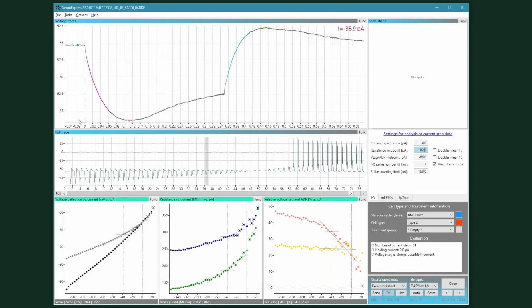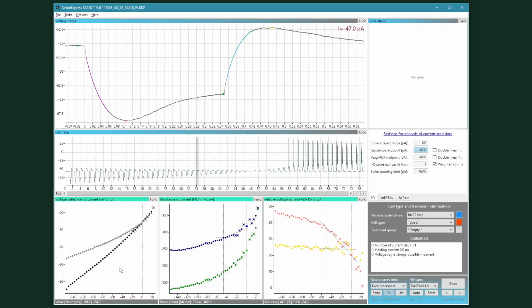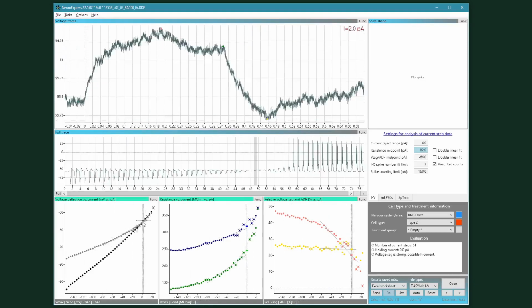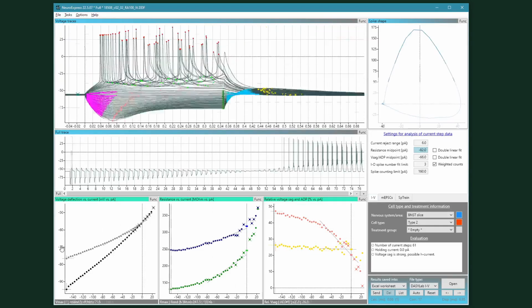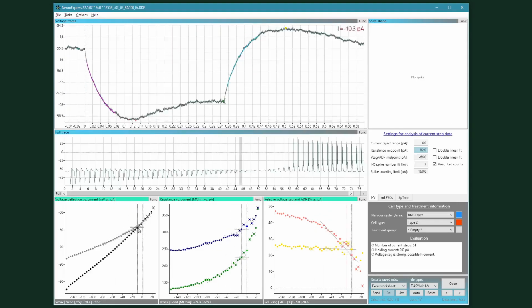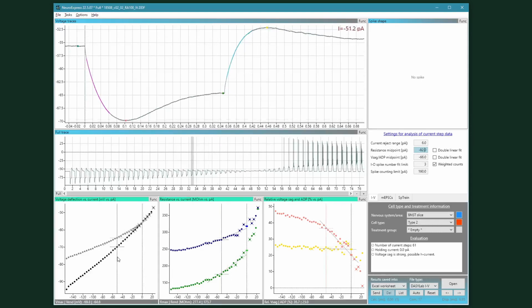So these are basically the membrane potential levels plotted against the current, and the slope of these relationships will be used to estimate the membrane resistance at I equals 0, that is when no current is injected. So the black trajectory will yield 272 megaohm. That is what we calculate from this linear fit.